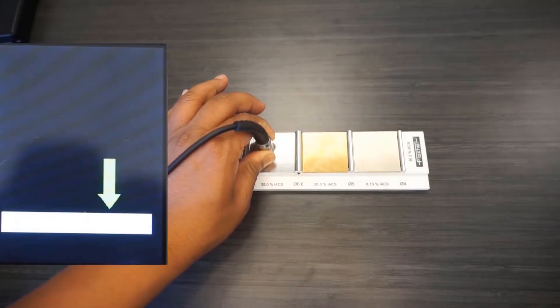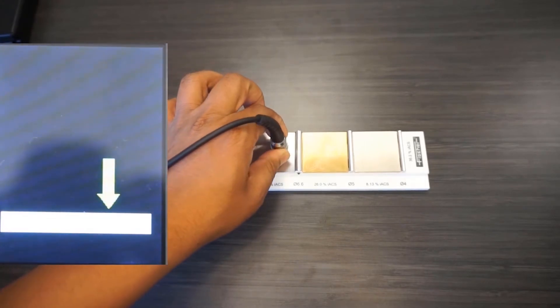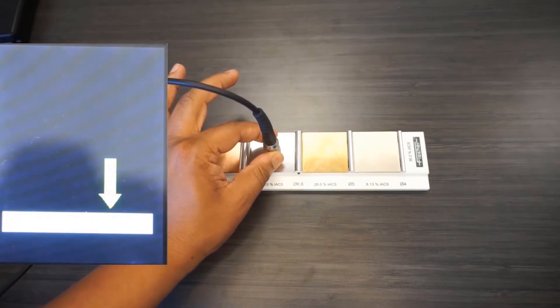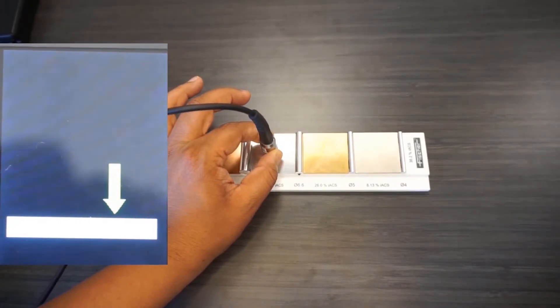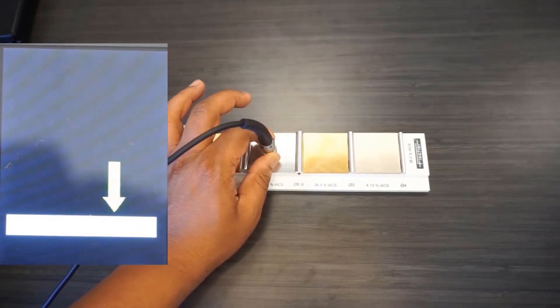Now let's compare the results to a gauge from a competitor that shall remain nameless. I'm following the same one-point calibration procedure with this unit on the flat substrate. Again, I'll make five measurements on the bare substrate.